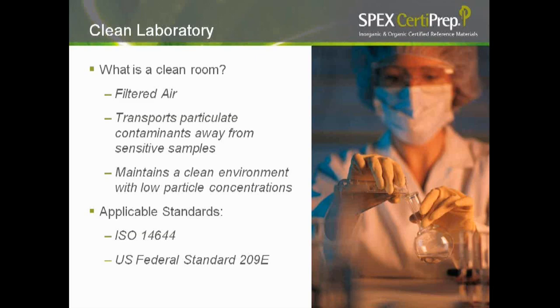Applicable standards for this are ISO 14644 and the US Federal Standard 209E. The US Department of Commerce has discontinued the FS 209E. However, it is still widely used by the industry. As per my definition earlier, a typical clean room will have a controlled level of contamination that is specified by number of particles per cubic feet or cubic meter for a specified particle size.